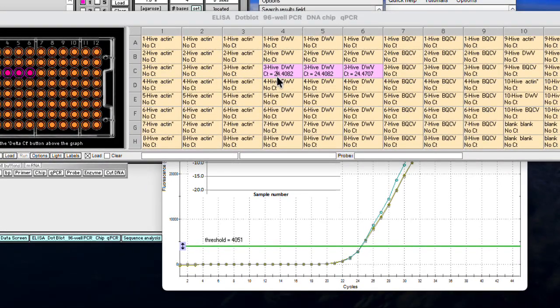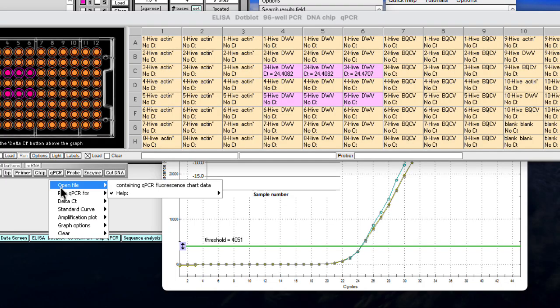Let's do 3 samples at 1 month, and for that I'm going to select E4, E5, and E6, as you can see over here. Let's go ahead and run that for purple wells only.